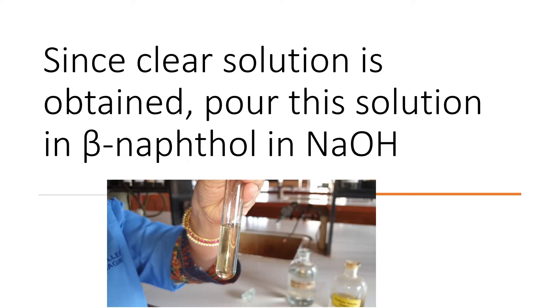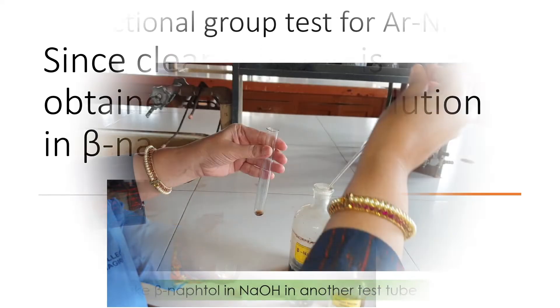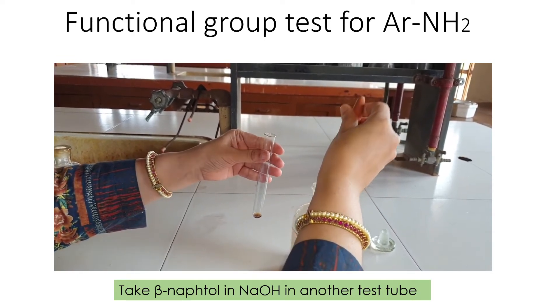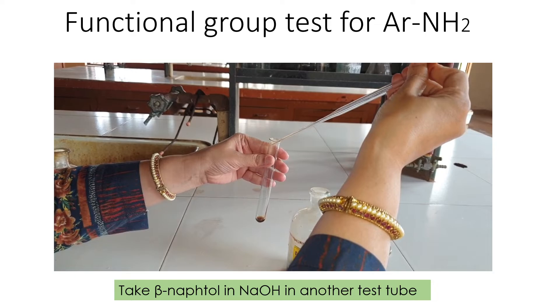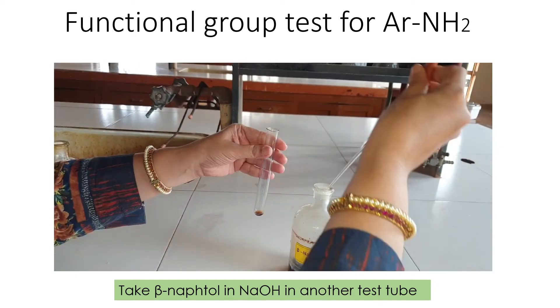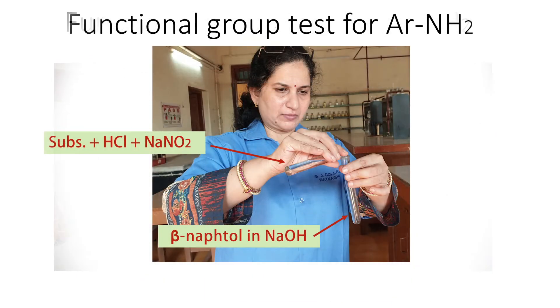To check for the presence of a primary amine we will pour this solution into beta-naphthol in NaOH. Take beta-naphthol in NaOH in another test tube. Now pour the clear solution obtained earlier — that is, substance plus HCl plus NaNO₂ — into the beta-naphthol in NaOH and observe the color.